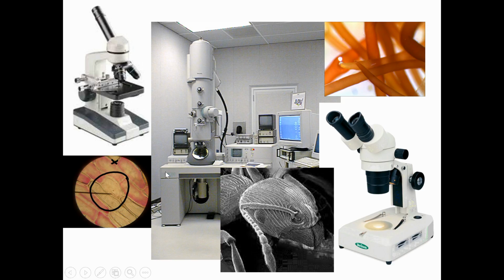And then in the middle, this large contraption is an electron microscope. So you would put your images or your objects actually inside of this tall thing here at the bottom. That's where the electrons go through. And then the computer would then analyze all the data and you'd get to see your images on the computer screen. So you could put an ant in there and look at the image very closely like that.